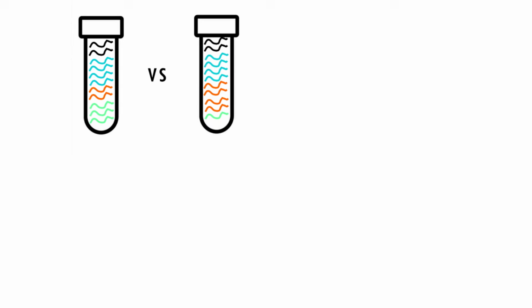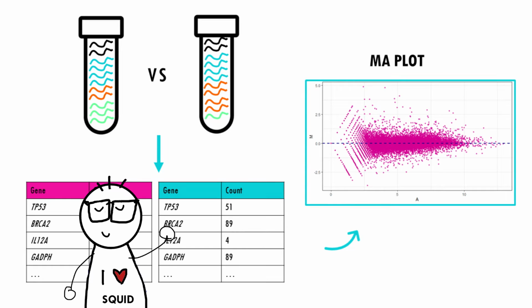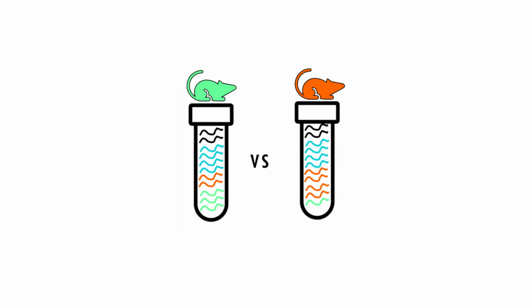Often when we're doing gene or protein expression analysis, we want to compare two samples or conditions. A great way to visualize your gene or protein expression across two conditions to get an overall understanding of your data is with an MA plot. For example, let's imagine we have two mice RNA-seq samples which have been sequenced. We now want to see whether there are big differences in gene expression and what genes do they affect. And a good start is with an MA plot.